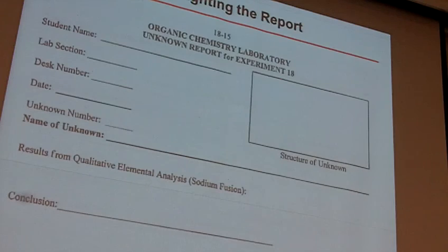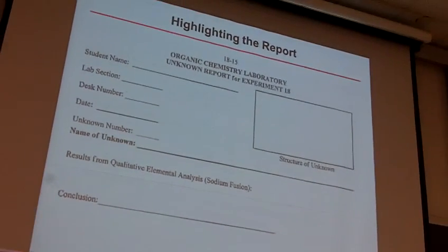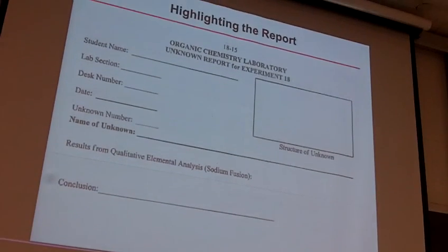Okay, so you get all this data. So let's see, what else am I thinking? There's also an IR. You know how to take an IR. That's old hat. So you add IR to this. Now, by the time you're done with lab this week, you'll have taken an IR, you'll have submitted a mass spec and an NMR, and you'll have done all of those chemical tests, or at least as many as you're directed to do. Solubility, the secondary test, and the flow chart. It's kind of a busy week. So you have all that information, and now in the course of the next 2 weeks, you have to use all that data to figure out what your compound is.